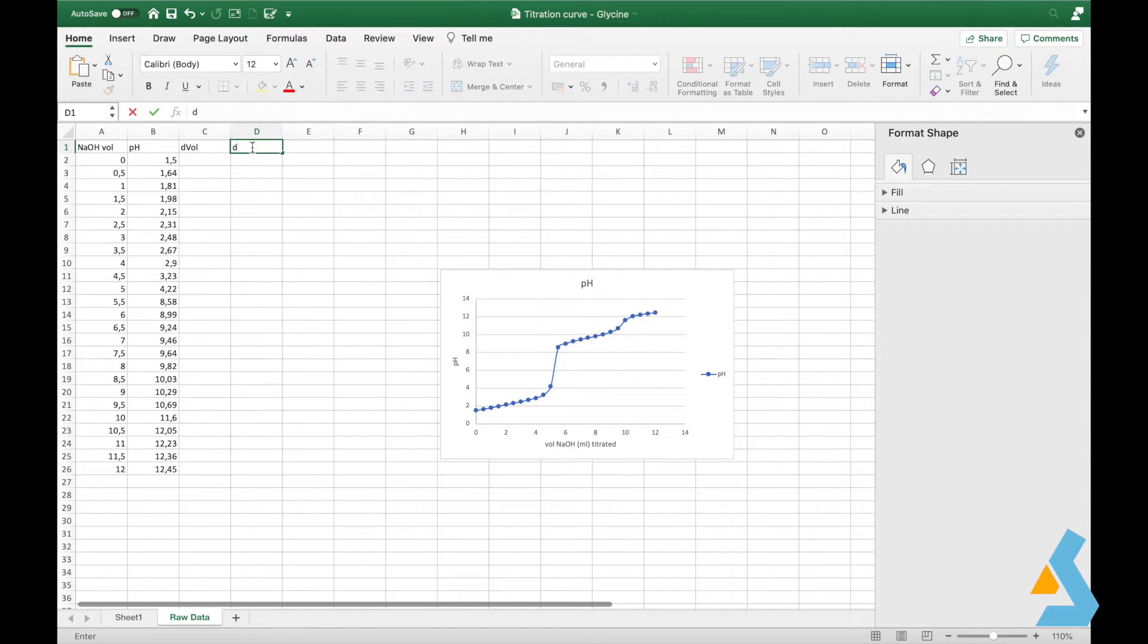For this, we need to define the derivative for this curve. Thereby, we add three new columns. The first one shows the change in volume titrated. For this, we will do a basic subtraction. As the additions were always 0.5 ml, we will see the same value for all subtractions.